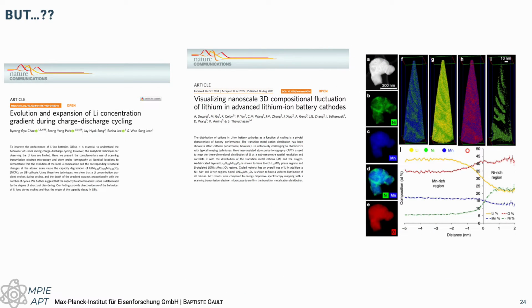However, if we consider again what had been published in the past, they didn't do this. They did not have a thin layer that was deposited on top. And so we went back to the samples and tried to reproduce what they had done.